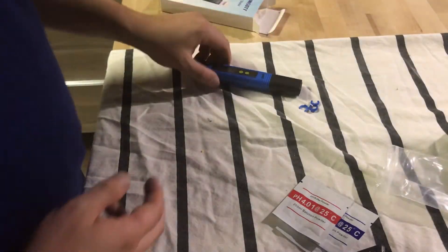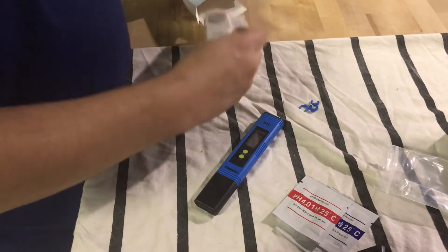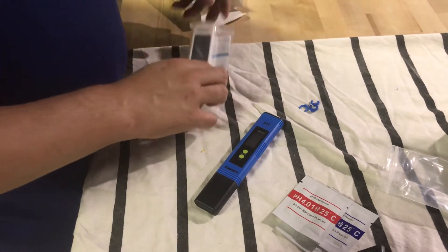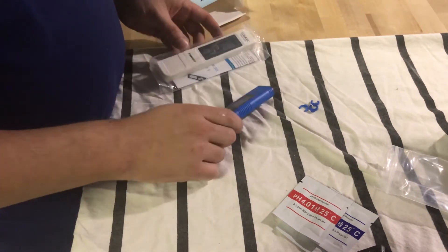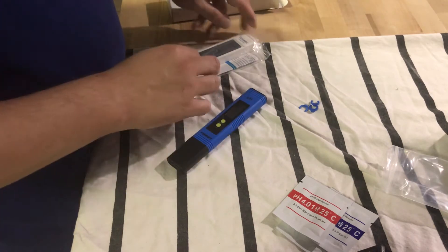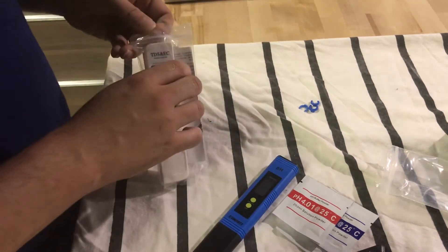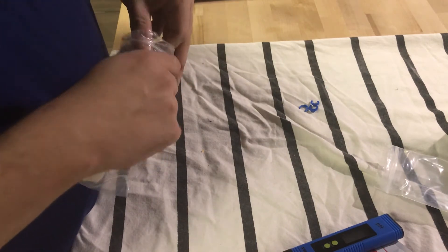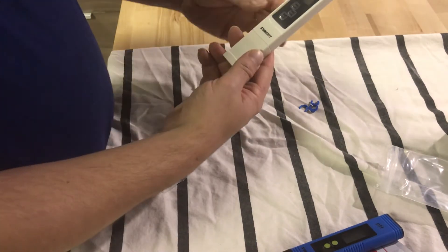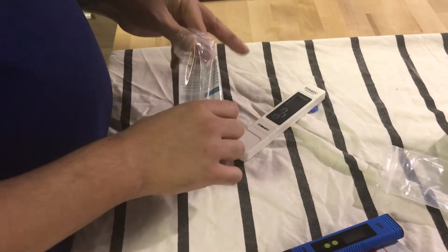Here's what it looks like. Something else was in here — oh, the TDS meter! So there are actually two separate meters. I didn't really pay attention to that when I was ordering it. There's a TDS meter and a pH meter. This is the TDS meter right here.